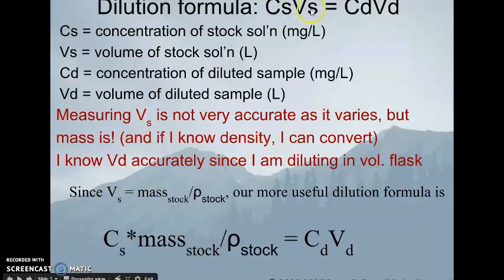in my dilution formula, I needed the volume of the stock, but I'm not going to measure that. Instead, I'm going to measure the mass of the stock. I can measure that accurately. The density of the stock, I will also know. It's also on the side of my stock bottle.